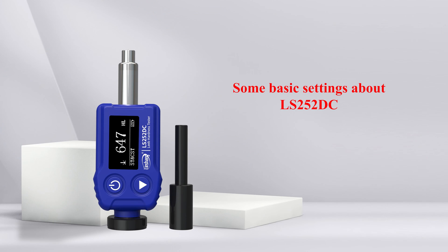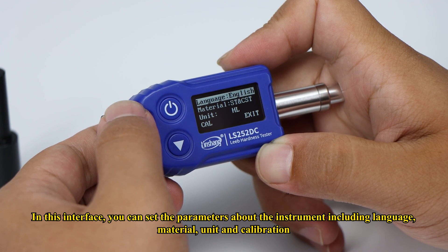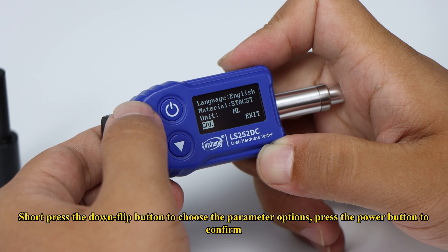Some basic settings about LS252DC: Short press the power button to enter the main menu interface. In this interface, you can set the parameters about the instrument, including language, material, unit, and calibration. Short press the down flip button to choose the parameter options, then press the power button to confirm.